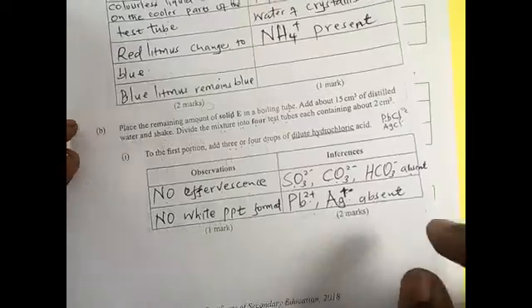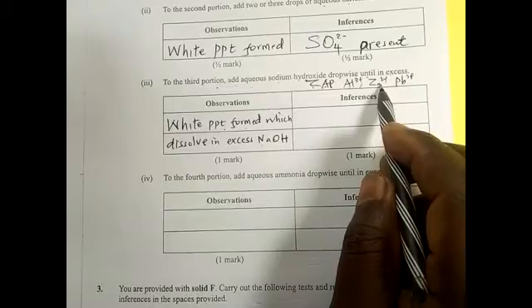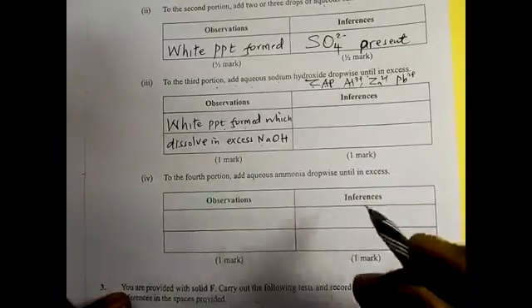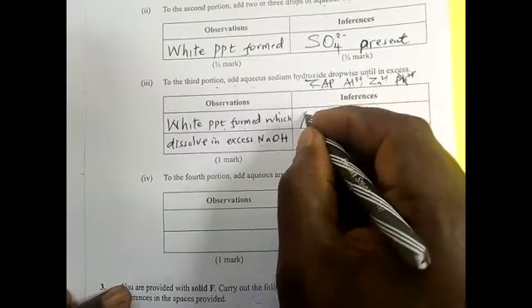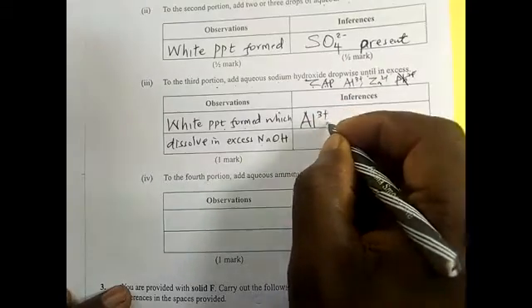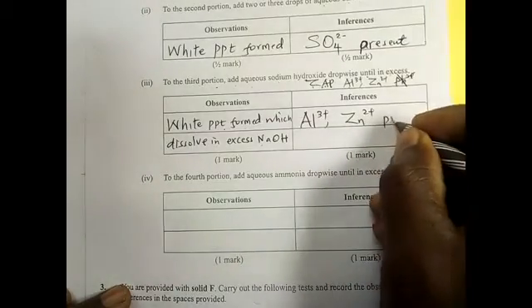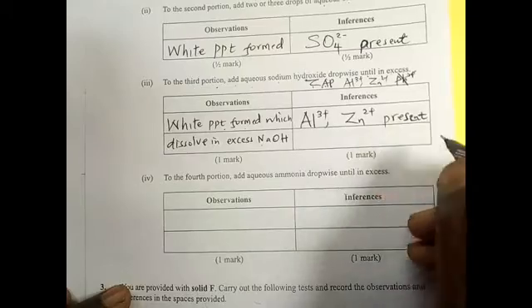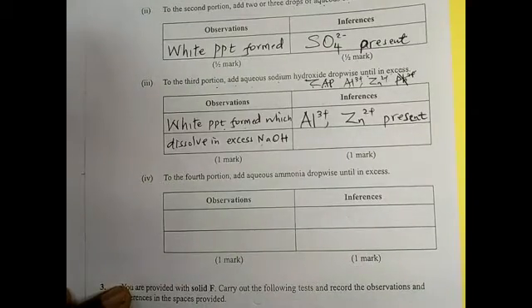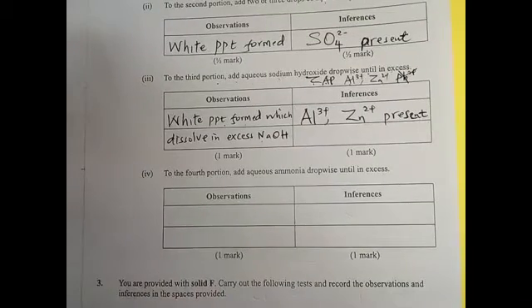So if you put it here that it is present, then you contradict yourself and you are likely to lose a mark. Therefore, we leave lead out, and then we infer that aluminium 3 positive and zinc 2 positive is present. We leave it out intentionally because in our previous we have said that it is not there.